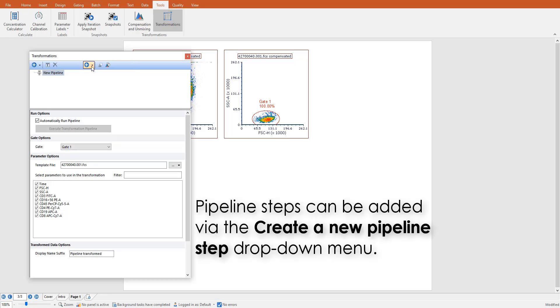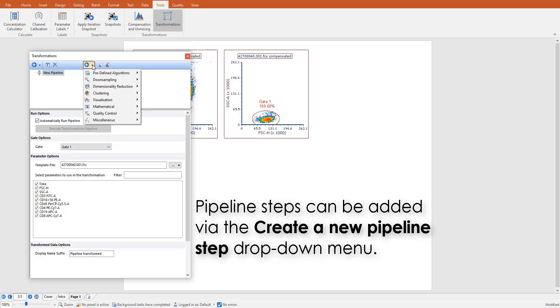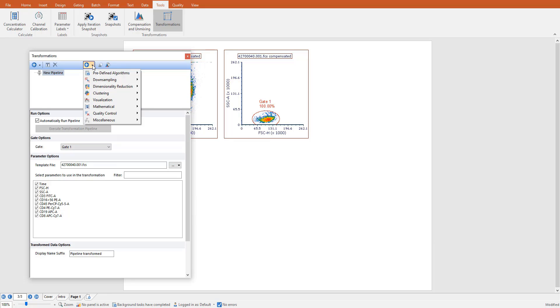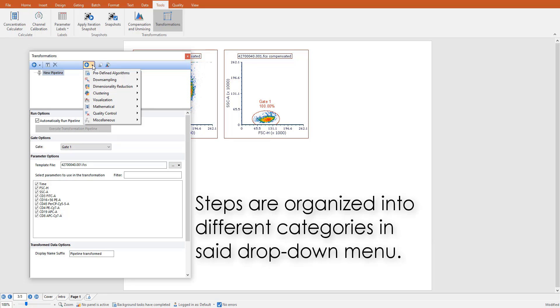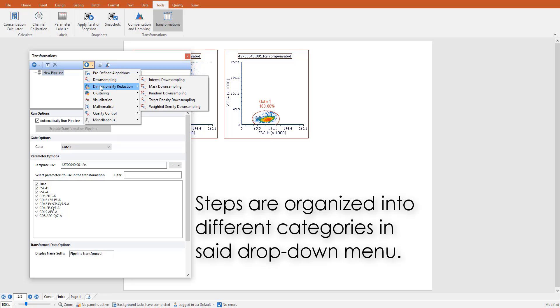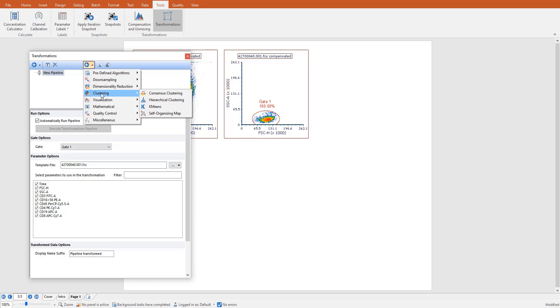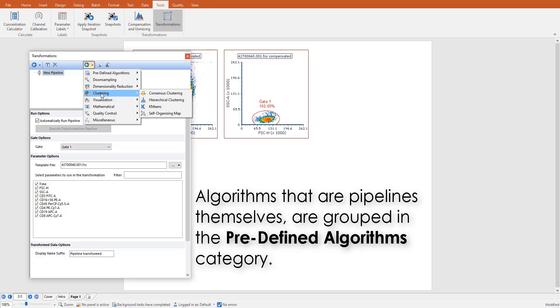Pipeline steps can be added via the Create New Pipeline Steps drop-down menu, which lists all the available steps nicely organized in different categories. Some of the algorithms used nowadays in flow and image cytometry are pipelines themselves; users can add them all at once via the predefined algorithms category.